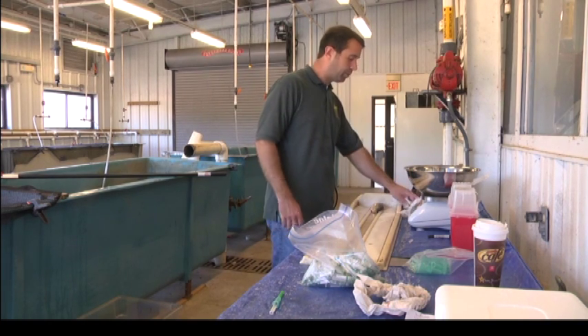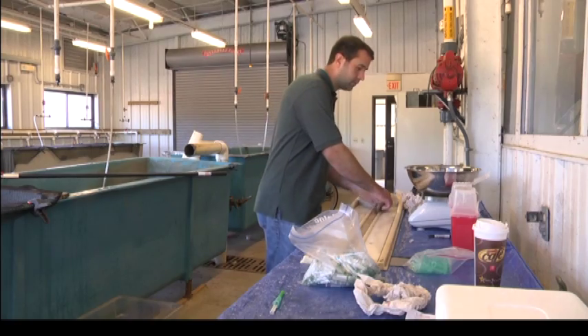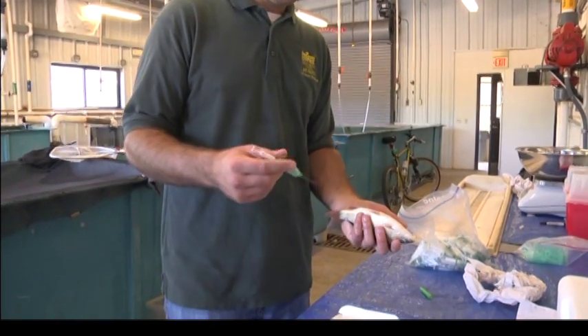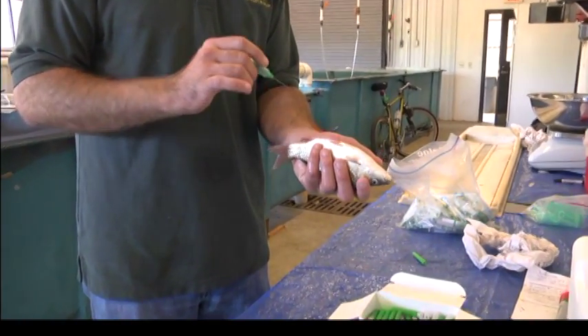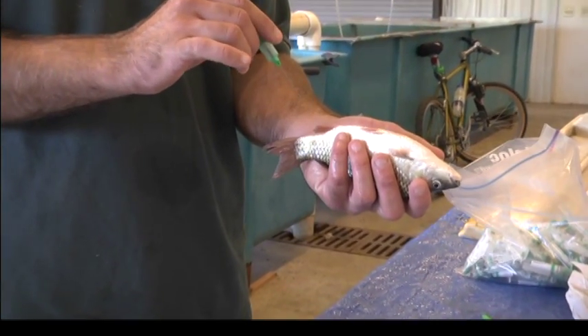162 grams, 20.3 centimeters. One other thing about when you actually push the vacutainer down onto the needle — again, you don't want to do that until you know you're on the vertebrae and know you're on the caudal vein.